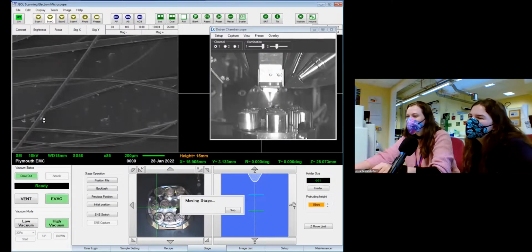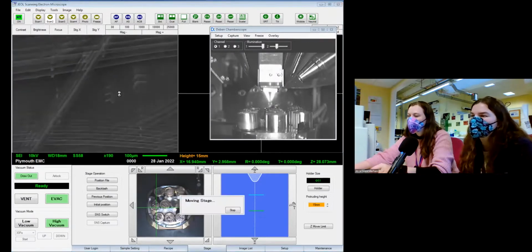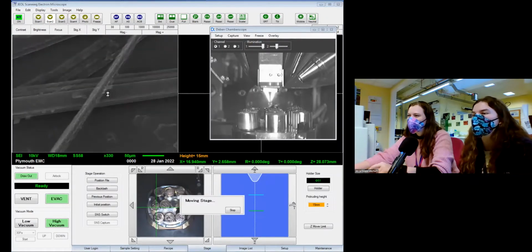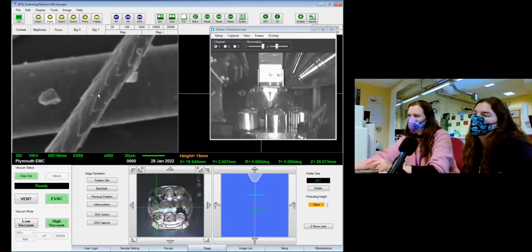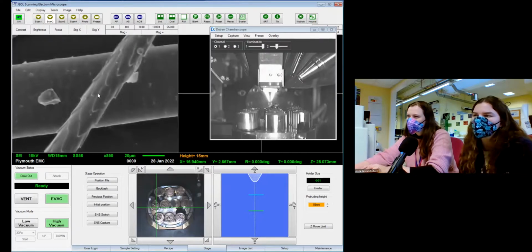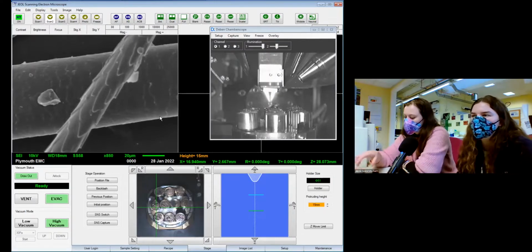We'll look at the hair first, then we can do the claw. Getting hair from Wanda wasn't too difficult because she molts so much. She's also got a brother called Cosmo, named after the TV show Fairly Odd Parents. They feel quite different as well. Wanda's fur usually feels a lot rougher than Cosmo's. I don't have any of Cosmo's hair, but it'll be cool to see if her hair looks like it would be rough.